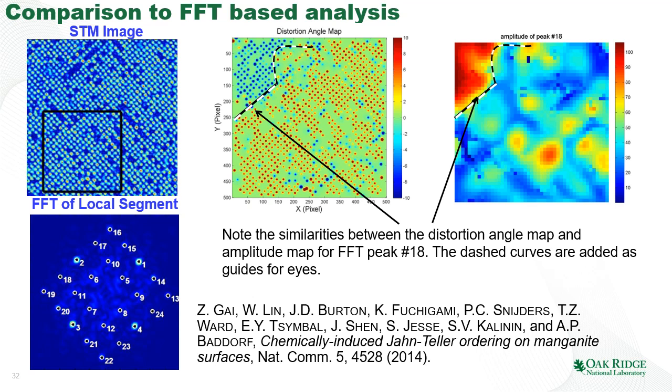However, if you compare the Fourier transform-based analysis and distortion analysis, you can see that the representation and the quality of the data are much, much clearer in the case when we go through all the exercise of atom finding and the image-based analytics.